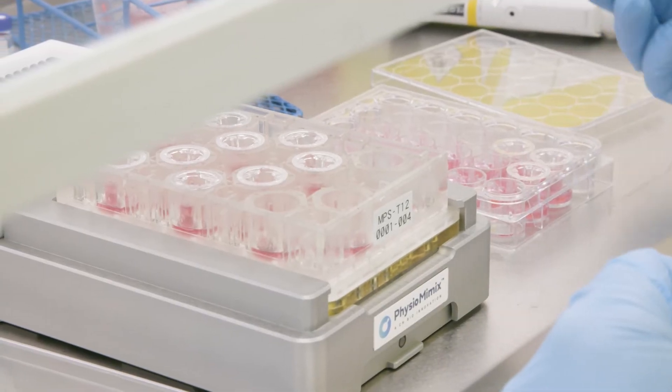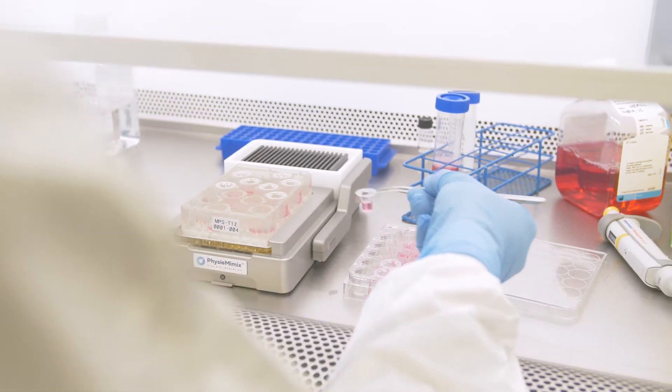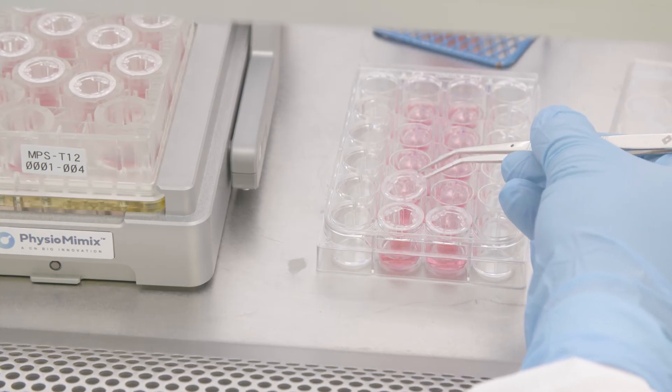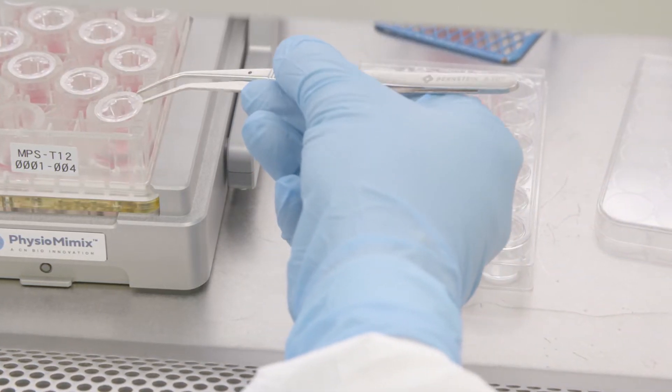The multi-MPS T12 plate is used to model barriers, including those found in the gut, lungs and kidneys. Simply seed cells of choice onto the T12 inserts and transwells and transfer these into the T12 plate.